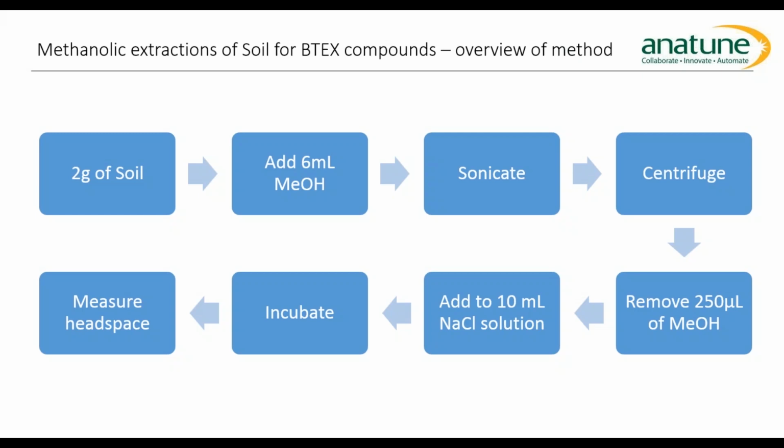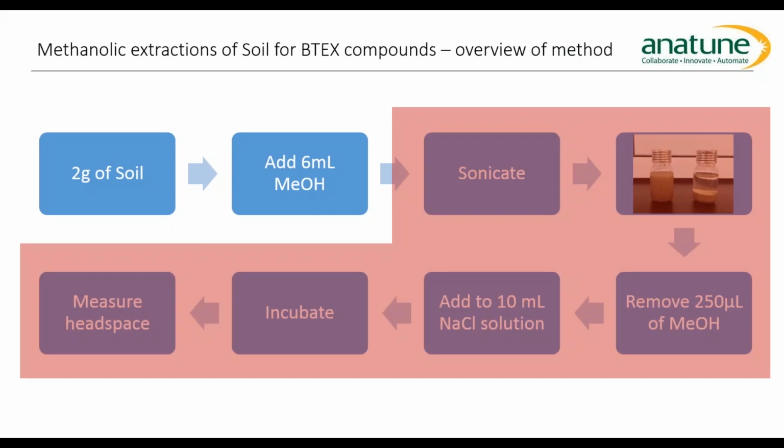And by using the Gerstel MPS system, we can actually automate that whole part of the process. So from the sonication onwards, through centrifugation, right through to measuring the headspace on the SIFT-MS, the whole process is automated, including the centrifugation, using the solvent-safe centrifuges that are available now on the Gerstel MPS platform. With the new robotic system, where we are able to change tools, it's probably possible to add the 6 mils of methanol into the system as well, automated. So in the end, the only thing you have to do for the methodology is actually weigh 2 grams of soil into your headspace vials and cap them up.